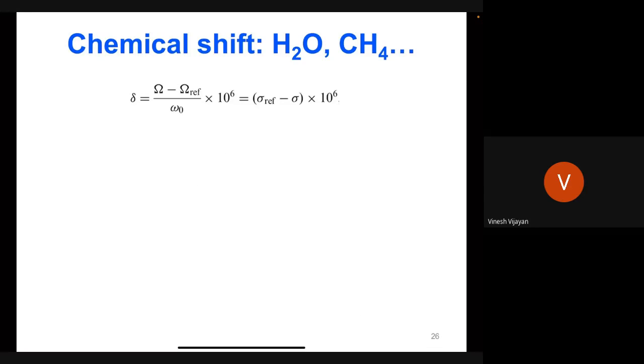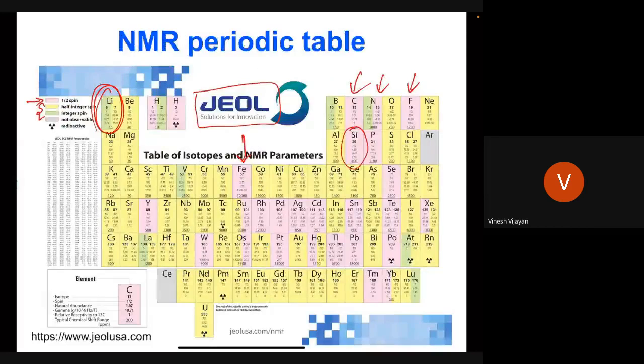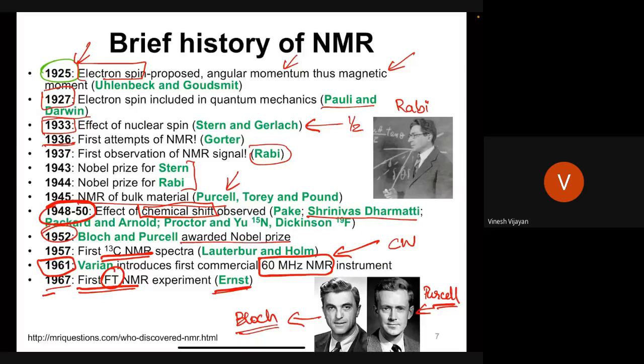The important aspect that one learns from NMR is something called the chemical shift. As I had told you earlier, the energy axis that is being shown in NMR is shown as ppm. That comes up largely because what we end up doing is that we have a certain reference in our system. So let me try to quickly go back to the sucrose NMR that I'd shown earlier.